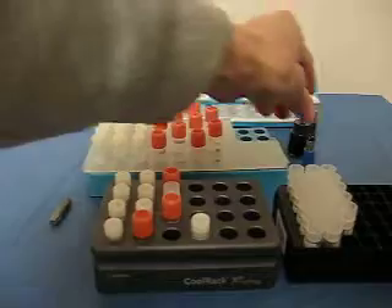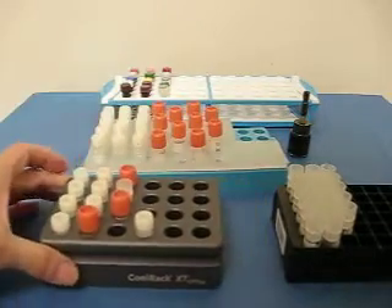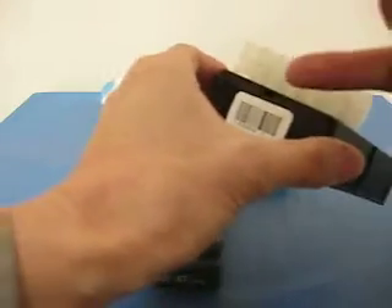Change to a different liner — a PP liner. This liner is very useful for bio-green or bio-1 choir bio-efficient vials while they are sitting so closely to each other on these robotic racks.